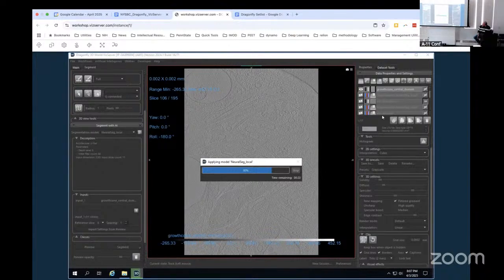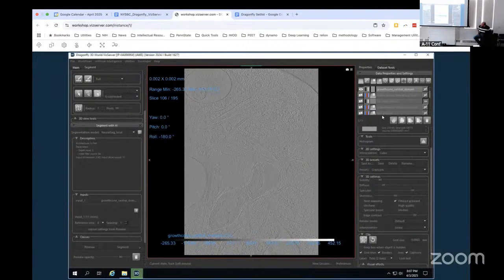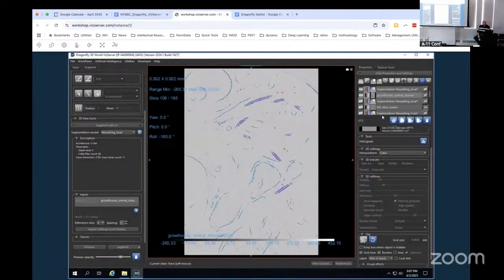This isn't even going to be that cool to see. It's a thick tomogram, so it's taking forever to break into patches. But Alistair was talking about signs of progress, like real measurable signs of being able to get subtomogram averages in an afternoon. I feel like getting a segmentation in a matter of minutes is pretty good.